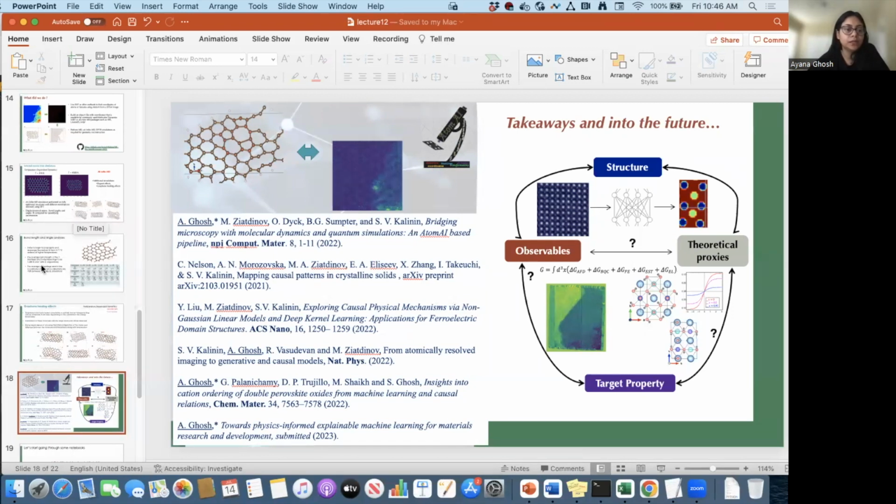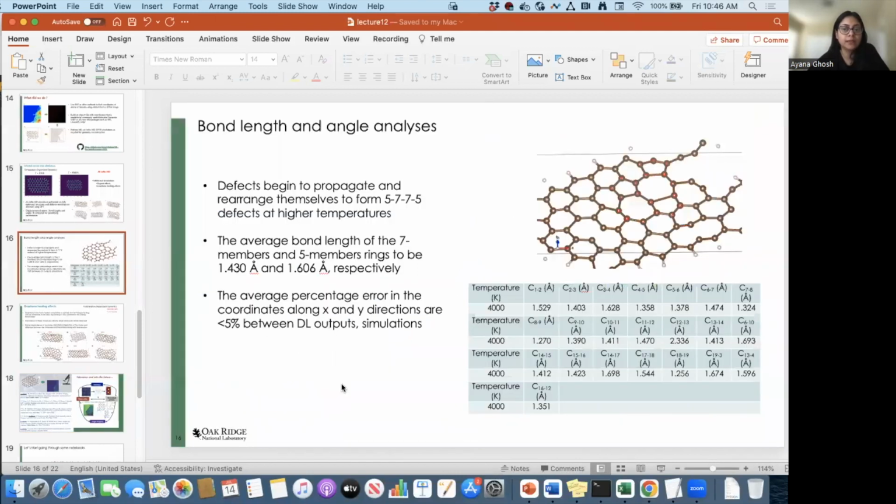We can talk a little bit about tracking the errors. How is it important? You could identify the atoms that you have created from your simulation object, then compare that to the full image and the semantically segmented map of those atoms, make sure those are the same atoms, and then look into the bond lengths and which atoms have moved where, so that you can actually identify which atoms have participated in the reconstruction of a geometry.